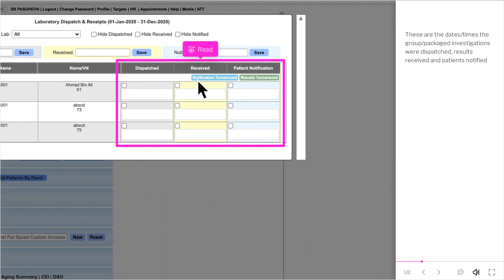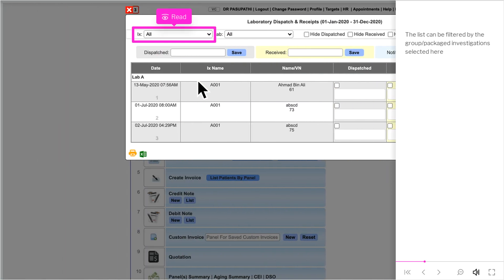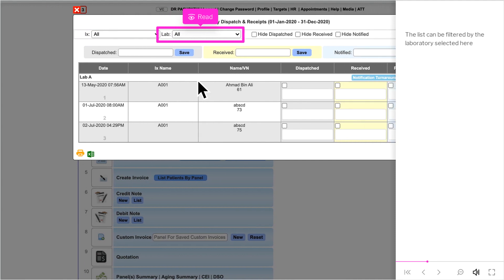These are the dates and times the group or packaged investigations were dispatched, results received, and patients notified. The list can be filtered by the group or packaged investigation selected, or by the laboratory selected.